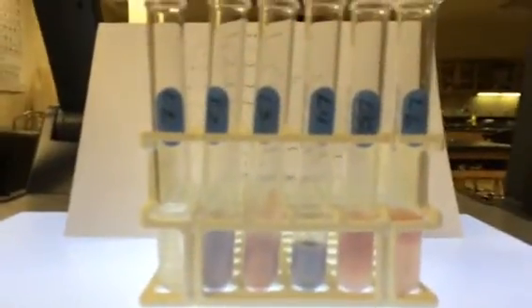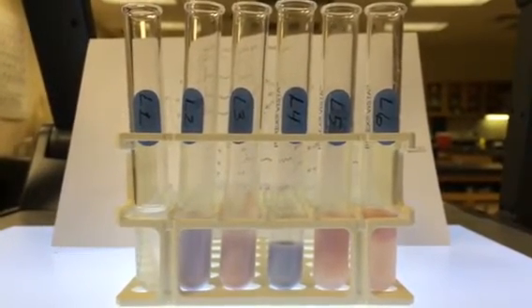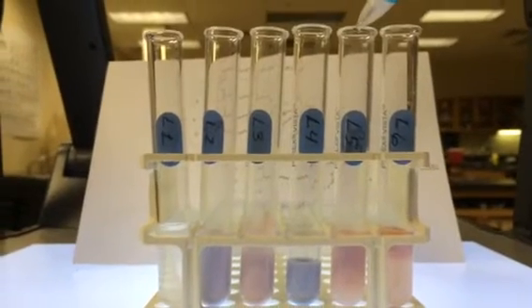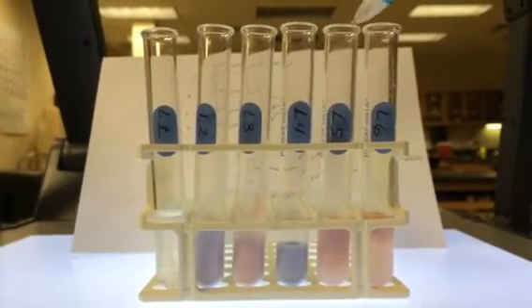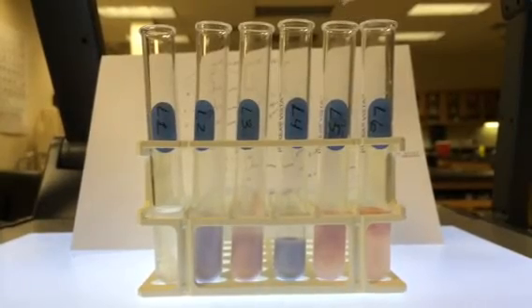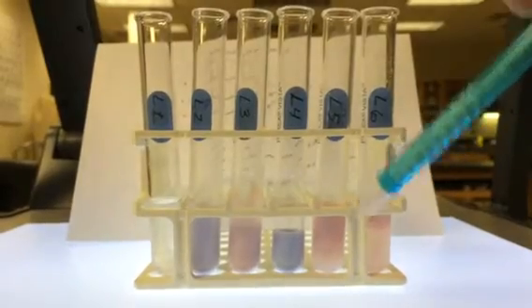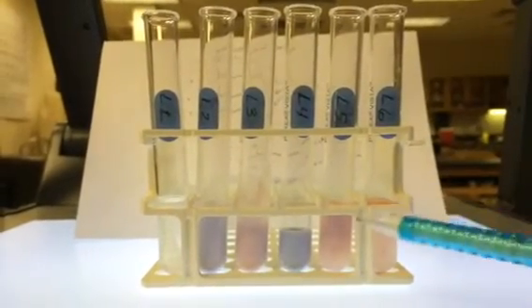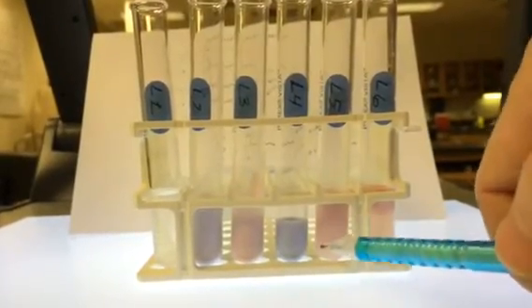So in test tube L5, you added litmus cream and lipase. And you know that litmus cream by itself is neutral, as we saw in L2. But in L5, we had lipase in there as well. And that was incubated for an hour at 37 degrees Celsius. And you'll notice that the solution turned pink. And pink indicates acidity.